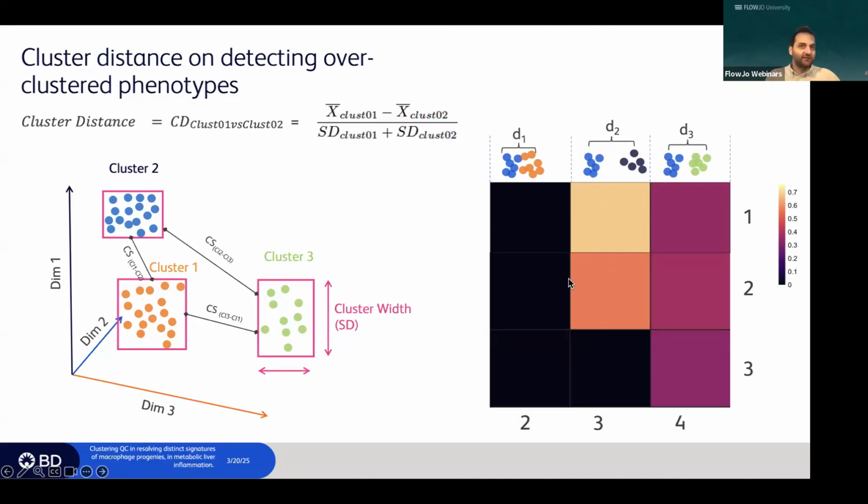Of course, it's very difficult if you have 30 or 40 clusters to look at all the clusters one by one. But what I would do is first find which are the most differentiated clusters among my conditions, look at them, and then run the tools to see if they're also pure populations to make my conclusions on.